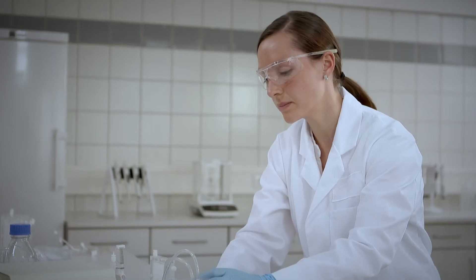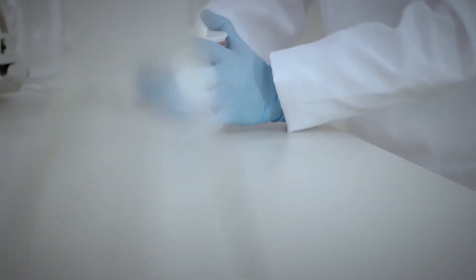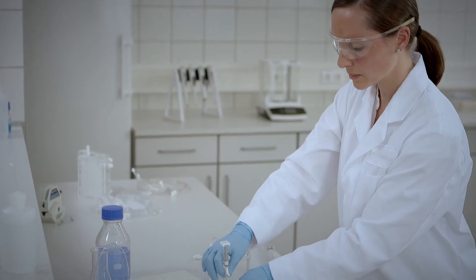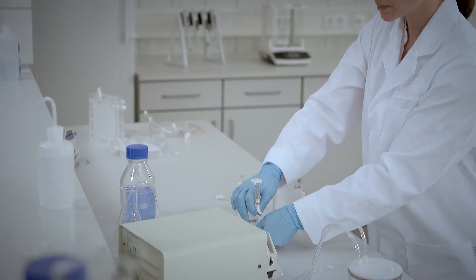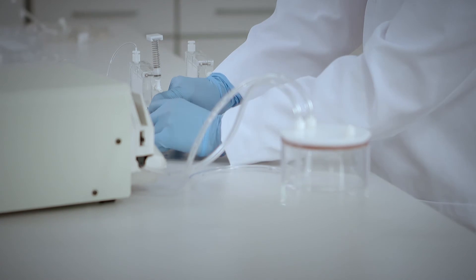Using just one VivaFlow 50R unit, you can concentrate up to half a liter of a solution containing proteins or viruses. For larger initial volumes of up to 1 liter, we recommend doubling the filtration area by connecting a second VivaFlow 50R unit in series.